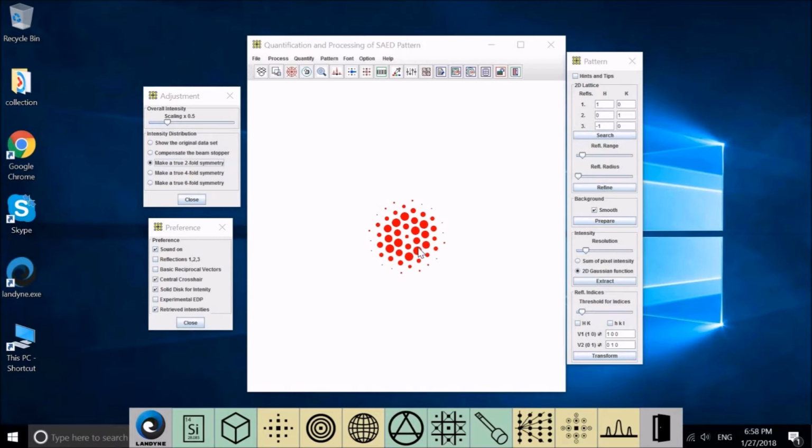To retrieve the intensity, we use the two-dimensional index system that just uses two short vectors in this pattern. The true index should be converted using the relation here.